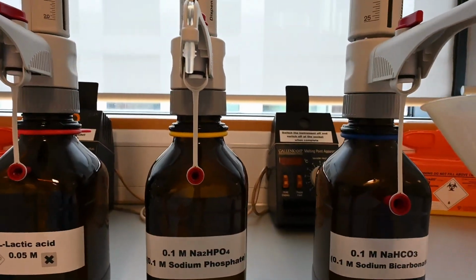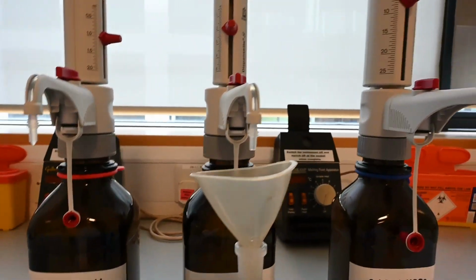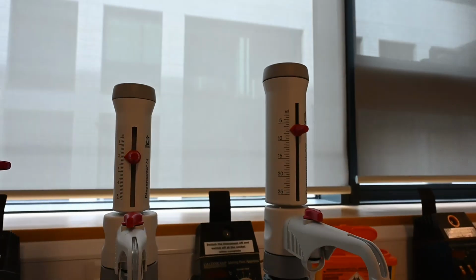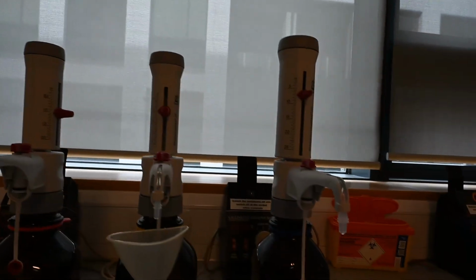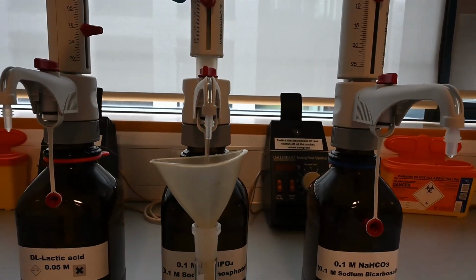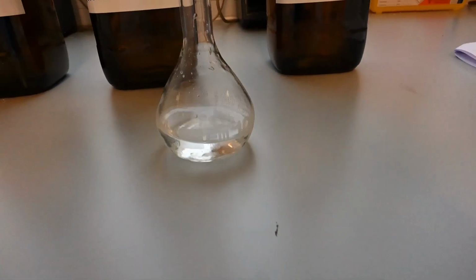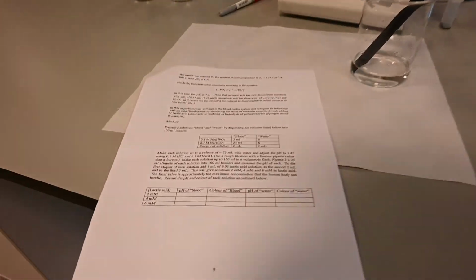Now, we also need 2 milliliters of sodium phosphate. So we're going to bring it over to the sodium phosphate, and it's set up to exactly 2 milliliters. Let me zoom in for you guys. There we go. It's exactly 2 milliliters. So now we're going to be taking it and gently adding the 2 milliliters. There we go. There's everything we need for our blood solution at the moment. We're now going to move back to our desk and we're going to continue forward.